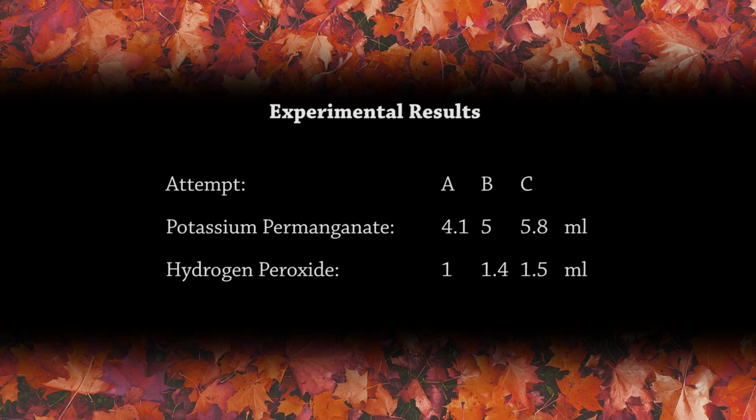Our experiment has yielded the following results across 3 iterations. These experimental value pairs are equivalent by mutual ratio, which varies in the range of 0.24 and 0.28 to 1 with respect to the principal reagents. If necessary, the second and third titrations can be performed by dispensing each reagent independently using the single fluid pipetting scale. This alternative approach may produce a more literal agreement of volume readings between titrations.